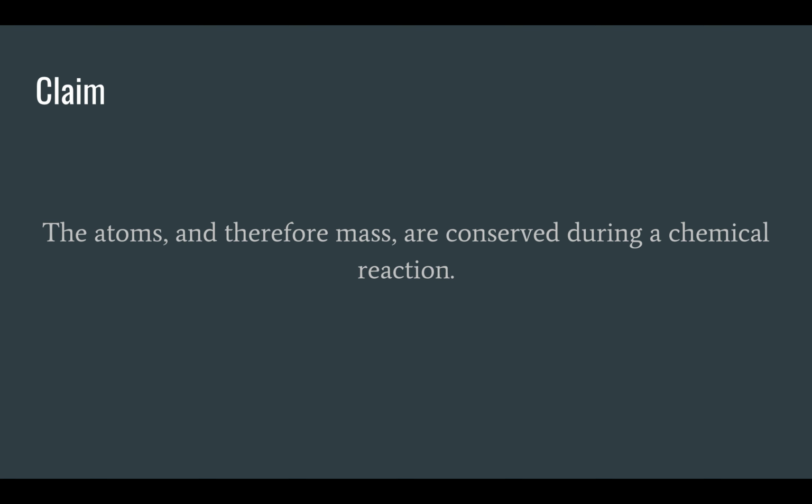The claim for this procedure is the atoms and therefore mass are conserved during a chemical reaction. Matter cannot be created or destroyed, which means that it is always conserved. No mass was lost or gained during this reaction, which is the law of conservation. The reactants consist of two oxygens and two magnesiums and end with the same amount.